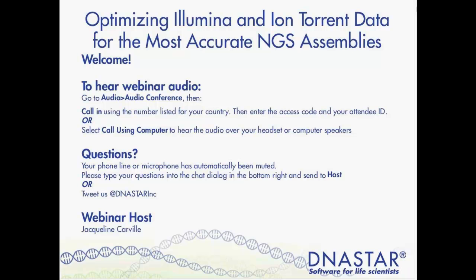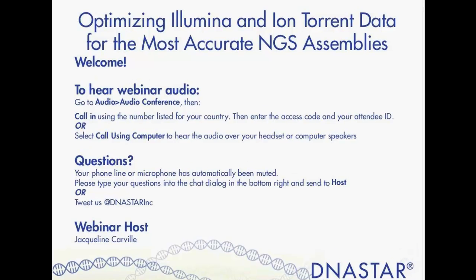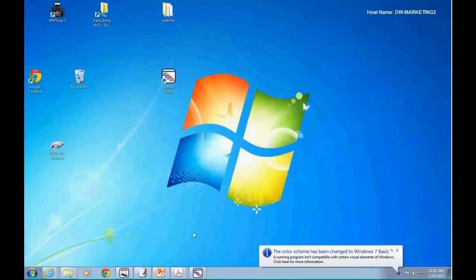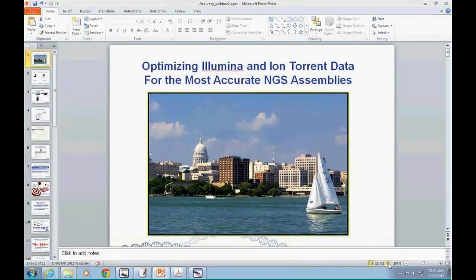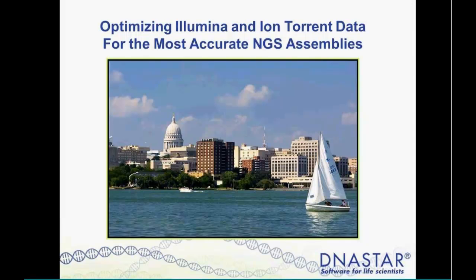Thank you, Jackie. Thank you for joining us today. I'm going to take just a second here and share my desktop. As Jackie mentioned, today is going to be a webinar that focuses on one of the newest workflows in DNASTAR software — using Illumina and Ion Torrent data in gene panel or exome assemblies. We have a mechanism now to assess the accuracy of those alignments, and I'm going to show you the process, how to do that in the software, and then we'll look at some of the results that have been published recently.